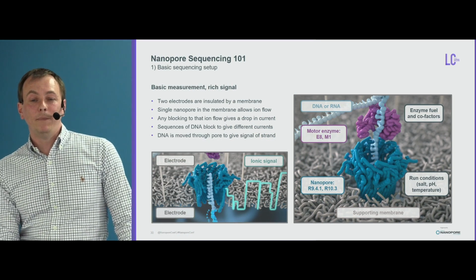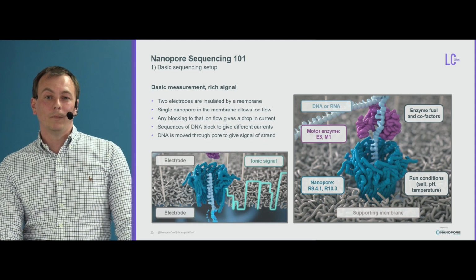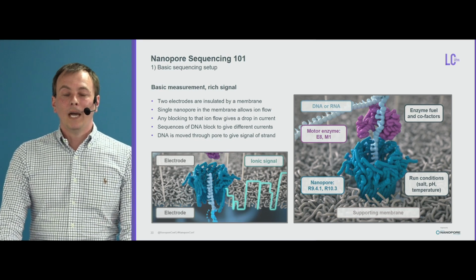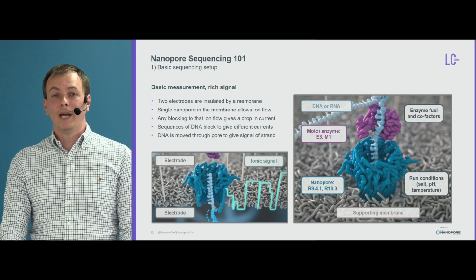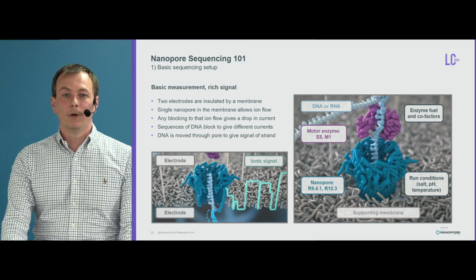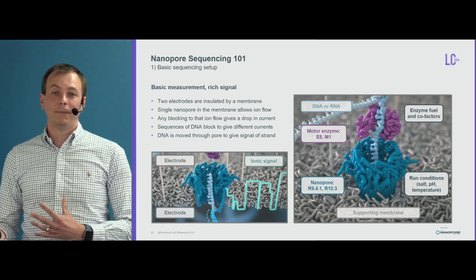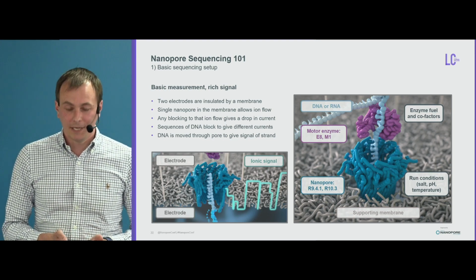We also have a choice of nanopore. We have the stable R9.4.1 release, which has been out for some time now, and we have the R10 series, which is in early access. An important feature of the R10 is that we deliberately engineer the pore to have a greater contribution from more bases, and that makes it better for resolving homopolymers. We've got a few things we can tweak within the system, such as temperature, applied potential, the enzyme cofactors, and we generally tune the system for accuracy.